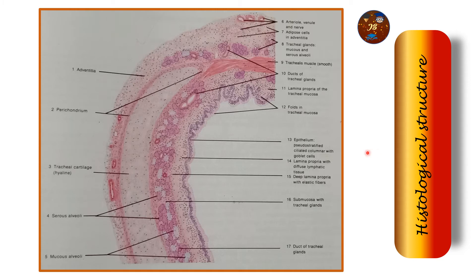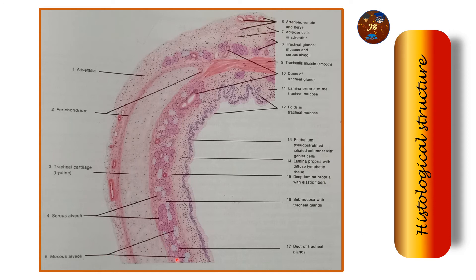Regarding the histological structure or the transverse section, the main identifying character is the tracheal cartilage, also known as hyaline cartilage. This is very important because it appears as a ring-like, U-shaped structure. Next comes the epithelium — it is pseudo-stratified ciliated columnar epithelium with goblet cells, which is another very important identifying character. You can also see the tracheal glands, the muscles of the trachea, and the ducts of the tracheal glands, as well as mucous alveoli and serous alveoli.